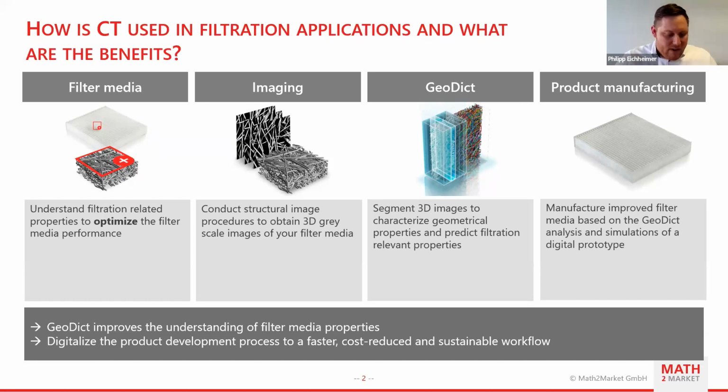If there are smaller fibers like nanofibers, we then move on to FIB-SEM or SEM images to have a better representation. And of course, the mixture of the fibers is also quite important so that you get a representative elemental volume here. Yeah, the mixture of the fiber is important in terms of getting better representative samples. So it's definitely helpful. I think we can go on to the next question. I'll save my question for later.